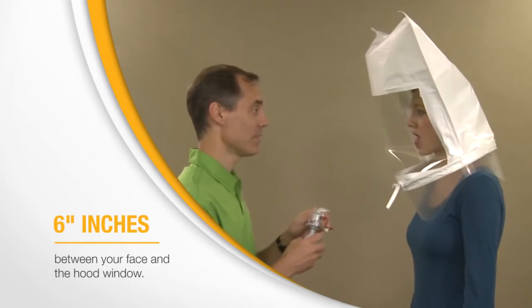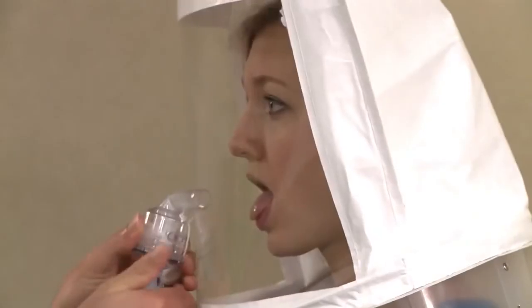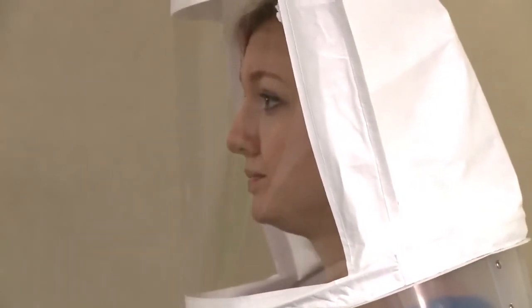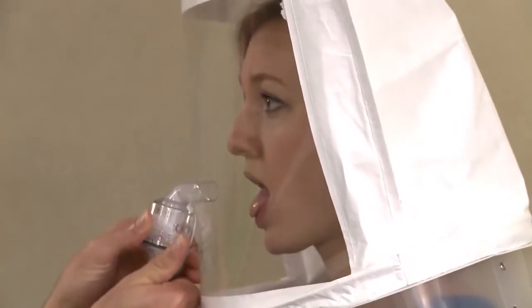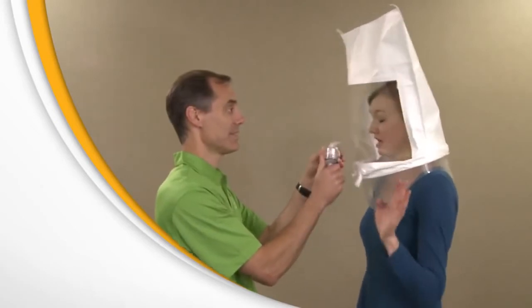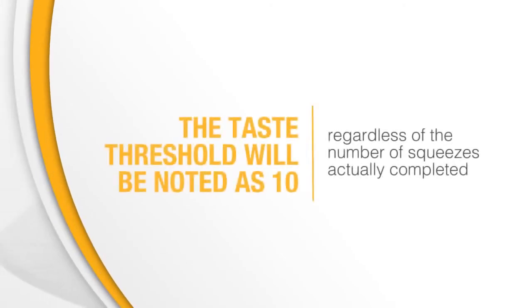Using nebulizer number 1, containing the sensitivity solution, the instructor will initially spray 10 squeezes into the hood through the hole in the window. You must breathe through your mouth and extend your tongue slightly. If you taste the test agent at any time during the 10 squeezes, tell the instructor. The taste threshold will be noted as 10 regardless of the number of squeezes actually completed.